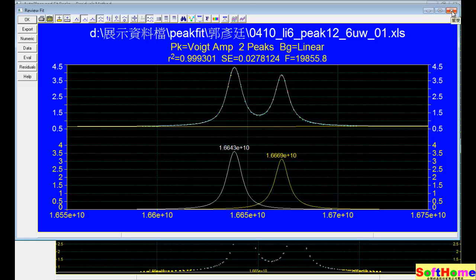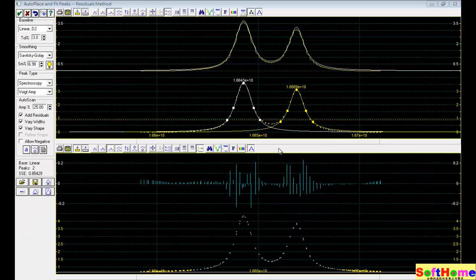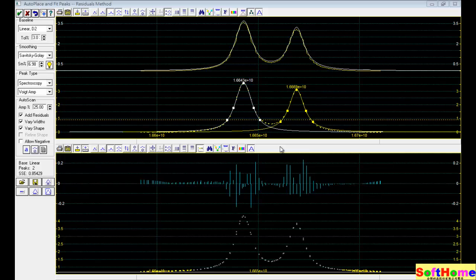So I recommend our customers use the automatic method. And the second method.